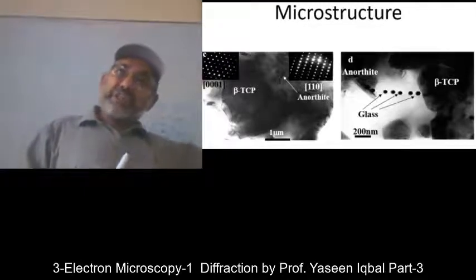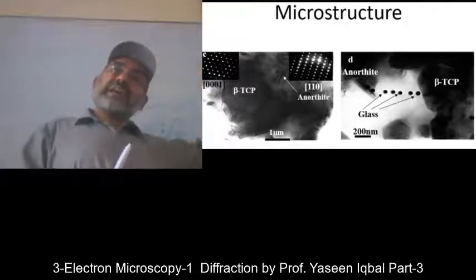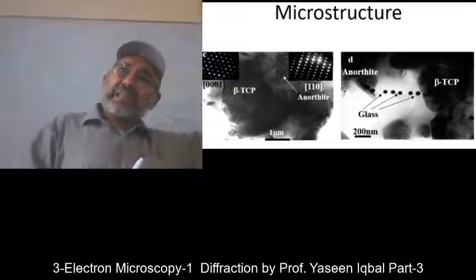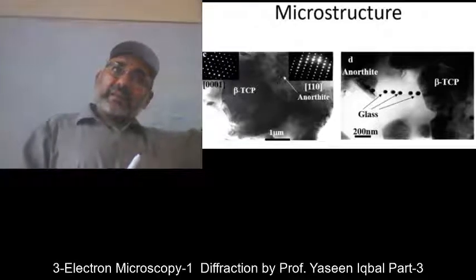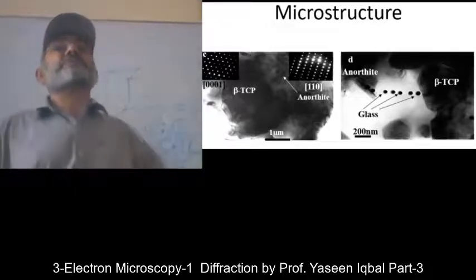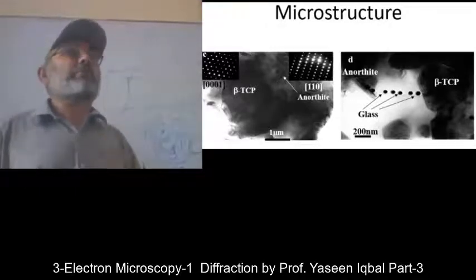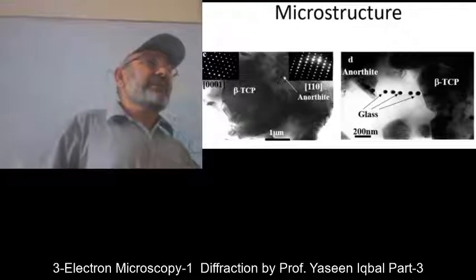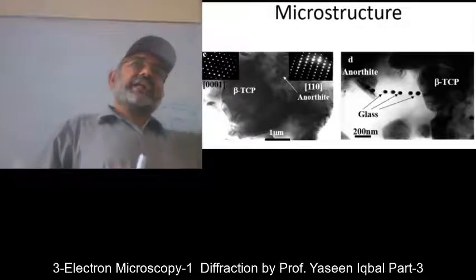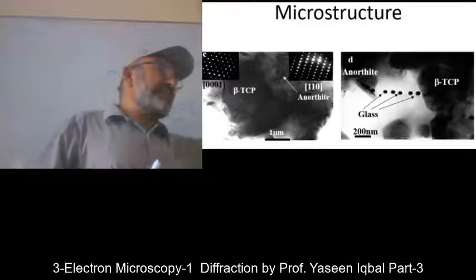So the morphology and the crystal system has no interrelationship in electron microscopy. Right? If a crystal is spherical, there is no spherical crystal system. So what it corresponds to? So the symmetry, the crystalline symmetry and the apparent morphology are different things.